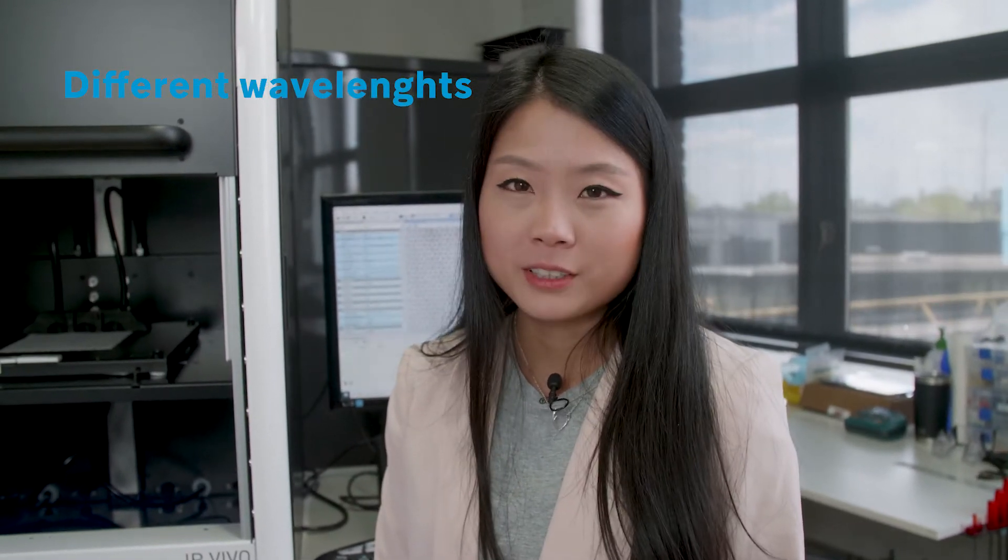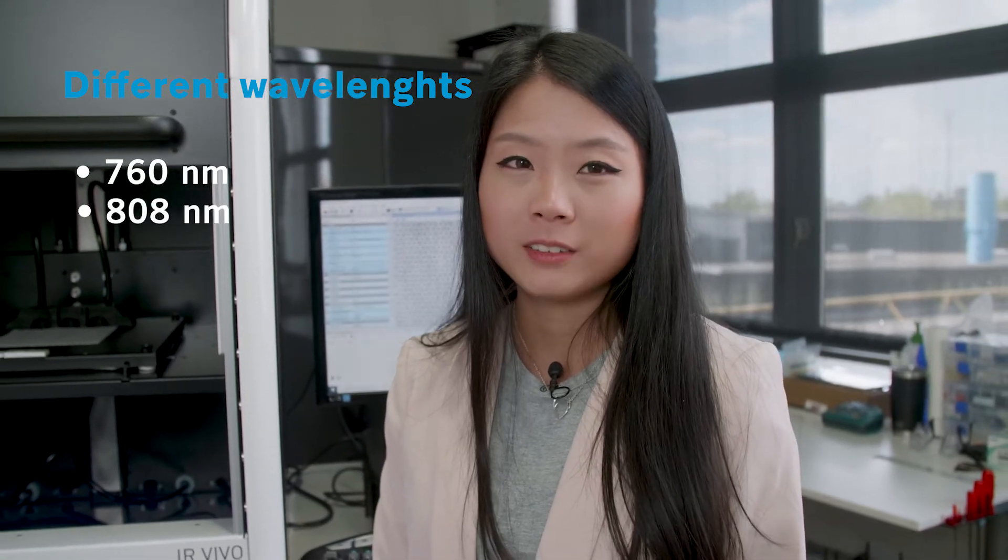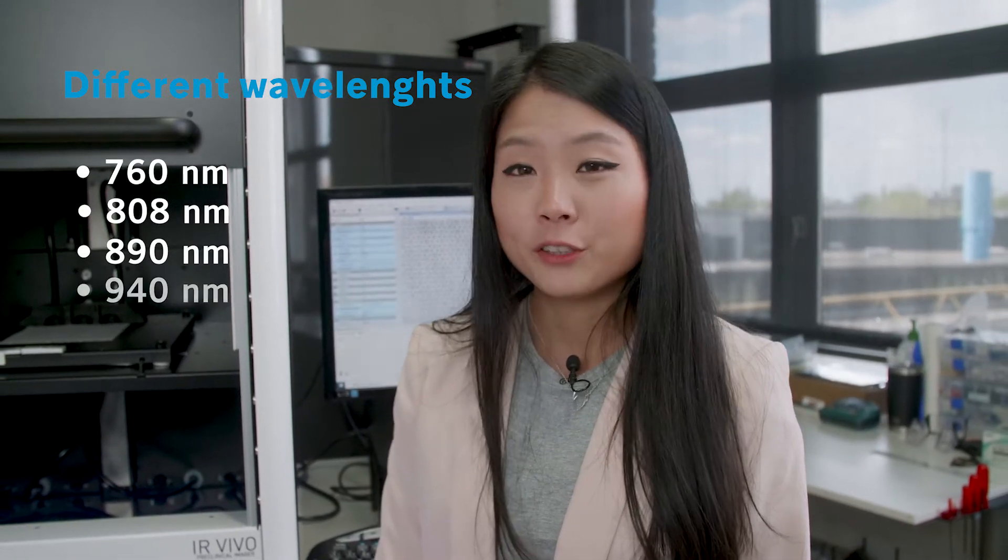First, the illumination module can have one to four different wavelengths. In this system, we have 760, 808, 890 and 940 nanometers.